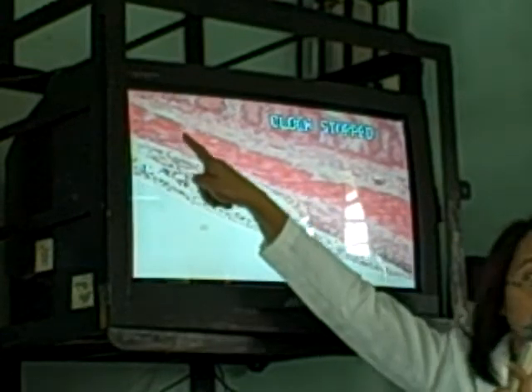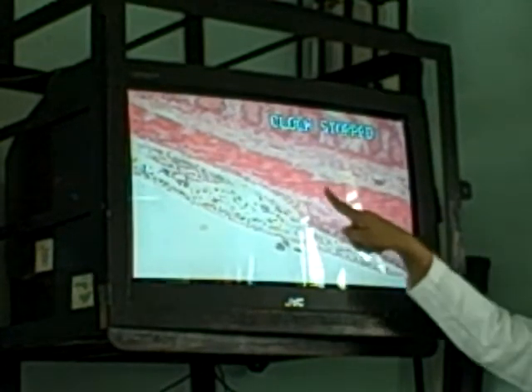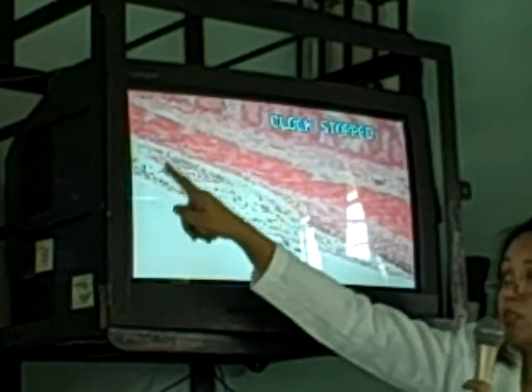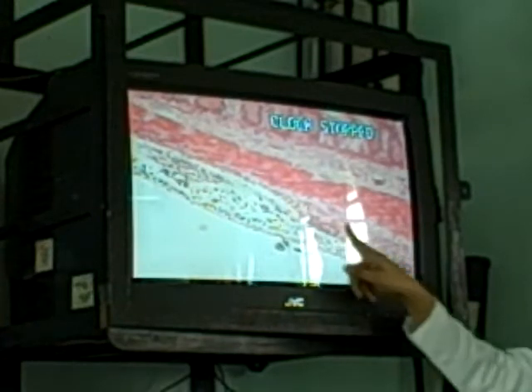Okay, please take note of this. This is your circular muscle layer, and then you have this, although very thin muscle portion, but they become thicker. This is your longitudinal muscle layer. So this is the one that forms the bands of your taenia coli. That's why they don't have it here, because they are collected as bundles, as taenia coli. Alright?